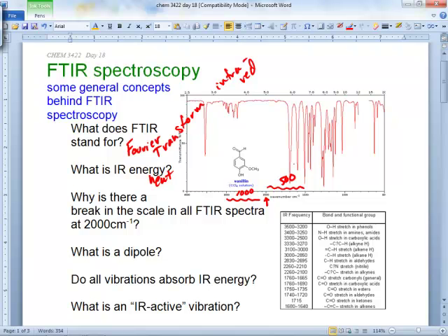Okay, so the step above 2,000 is going in jumps of 1,000. On our scale there, below 2,000, it's going in jumps of 500. And it's just, yeah. There's no functional groups that absorb in that region? You're getting there. Combine what you said with what Rob was mumbling here. I said there was a lot more stuff down there. A lot more stuff. But the stuff is functional groups. Yeah, a lot more functional groups. So they just want to zoom in here by increasing the resolution. That's all they're doing. It's just like zooming in.